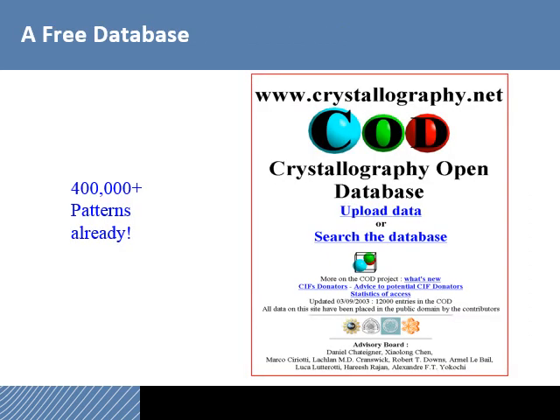If you don't want to spend money on a database, there actually is a free database called the Crystallography Open Database, or referred to as the COD. And the internet site is posted on the slide, www.crystallography.net. There are over 400,000 patterns in this database. They have a fairly comprehensive set of inorganics, but I would say the bulk of the entries are probably organic.